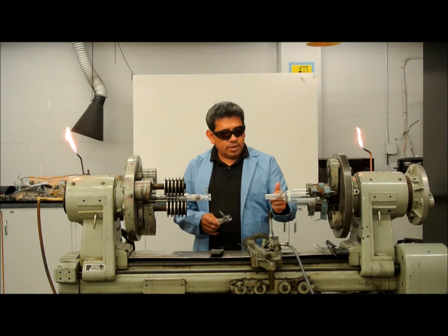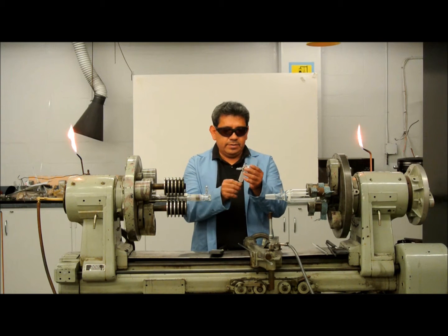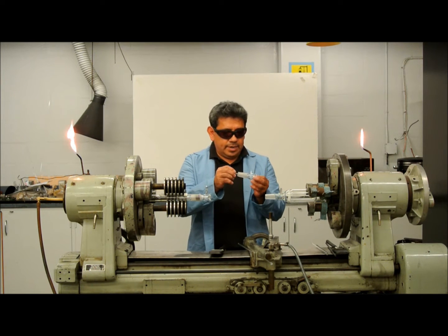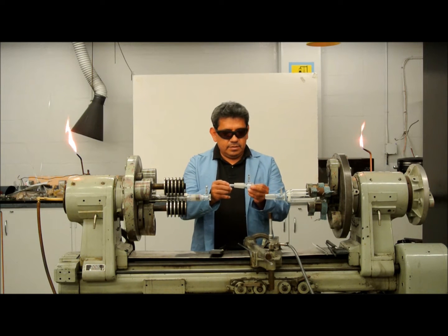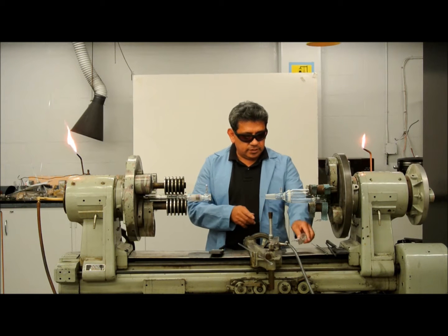So I'm going to replace it with one of these — a prefabricated piece that I made. I'm going to put it on this holder and there are two ways of fixing this.